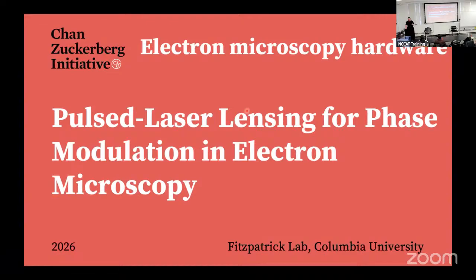And so one of the things that has been great to see about cryo-EM in general is this huge resolution revolution that started to happen around 2013, 2014. Quite a lot of that, as you probably heard in this course, was the detectors. So how we actually detect the electrons coming down the column, passing through the sample, and then going on to the camera. But another part of it, which is a bit overlooked because we take it as a given, is the quality of the lenses. So the lenses in general, how we focus and manipulate the electrons in an electron microscope, really has not changed for almost a century.